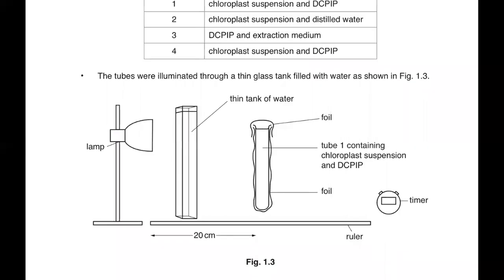In this video, I'll be covering with you the Hill's reaction and how the DCPIP actually loses its color, its blue color, when exposed to light. Because of the light energy, as it loses its color, you can note down the time taken for the DCPIP to lose its color. And the contents of the tube will again become green because the chloroplast has been added there.